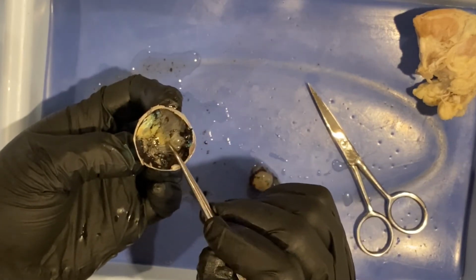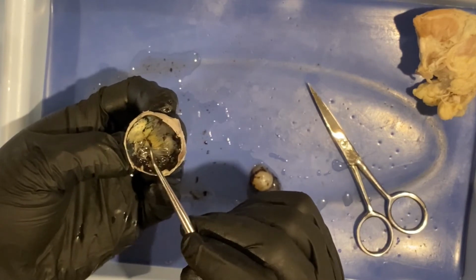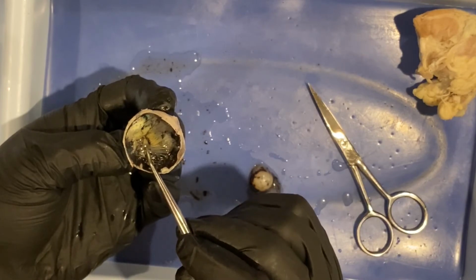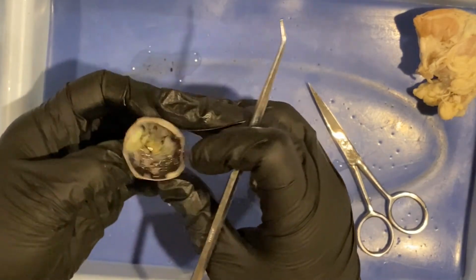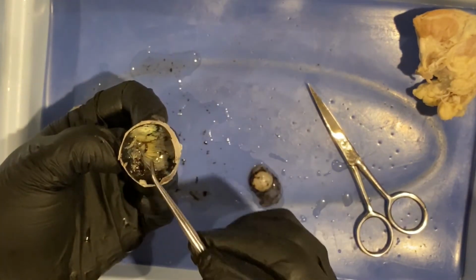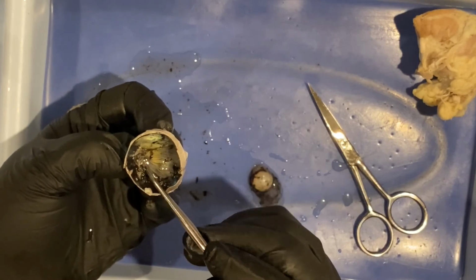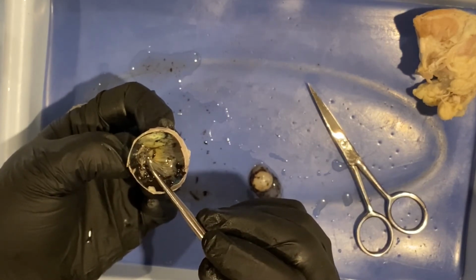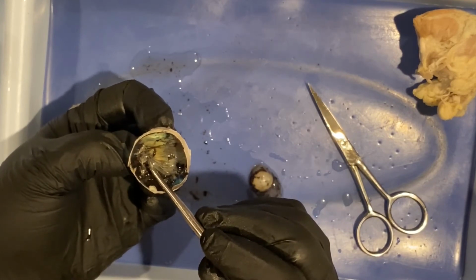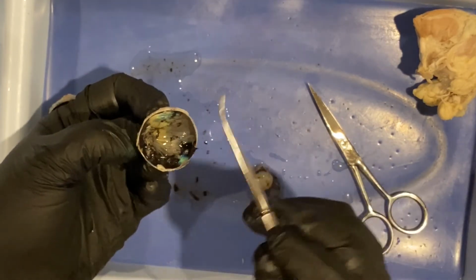But just medial to that, there's kind of this little dimple that develops, and this is because all of the axons of the photoreceptors start to come together and they go out the optic nerve. And in this spot, there are no actual receptors. It's just the axons of the receptors. This is referred to as the optic disc, but it's also the blind spot. You're not able to see anything if it lands on that part of your retina.